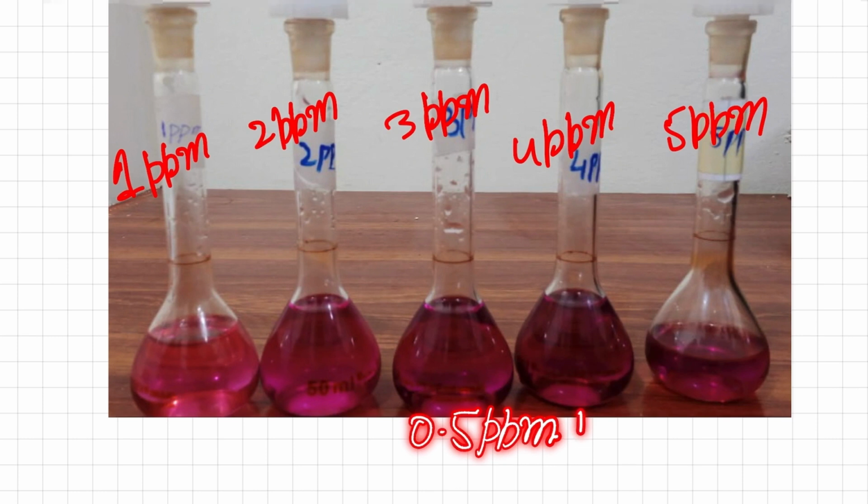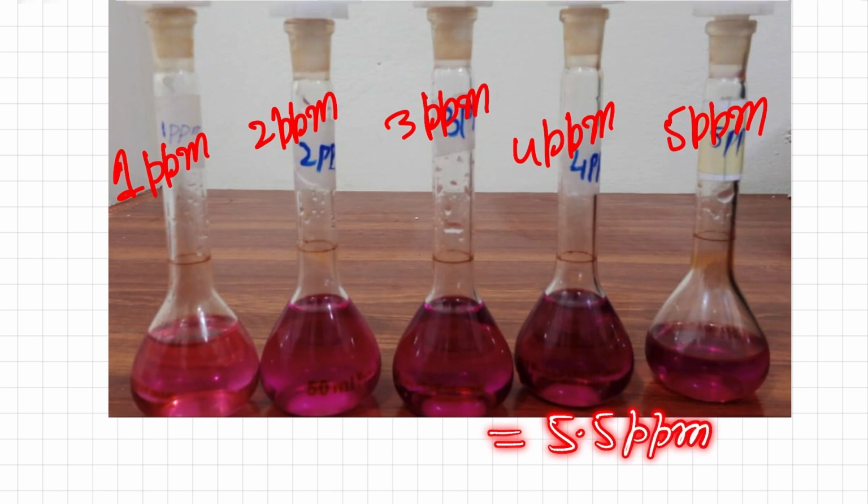What you will do is add on your own, for example, 5 ppm concentration solution to your unknown solution. Now the total value becomes greater than the detection limit. For example, now the final value comes to 5.5 ppm. So you already know that you have added 5 ppm by yourself.